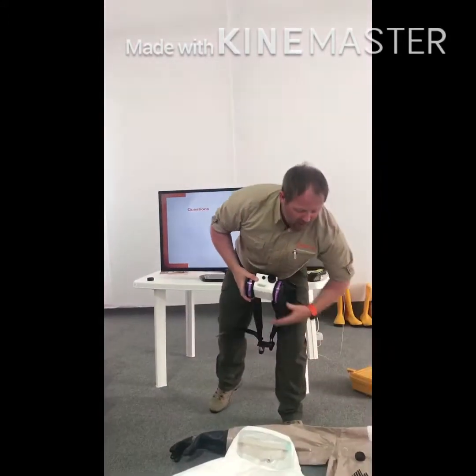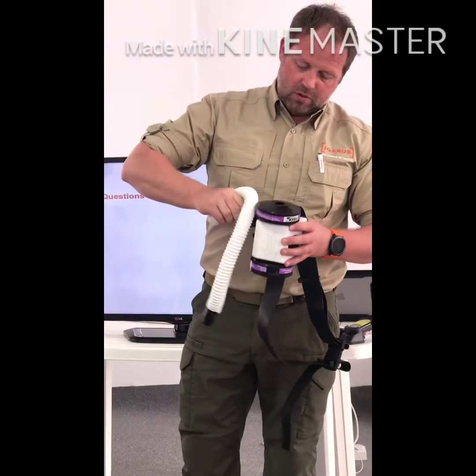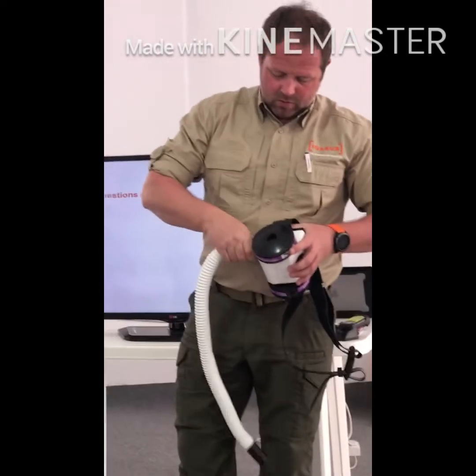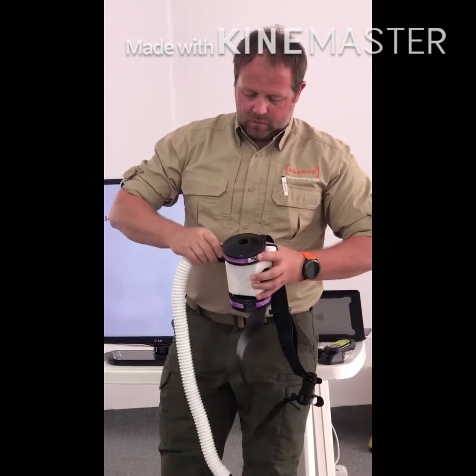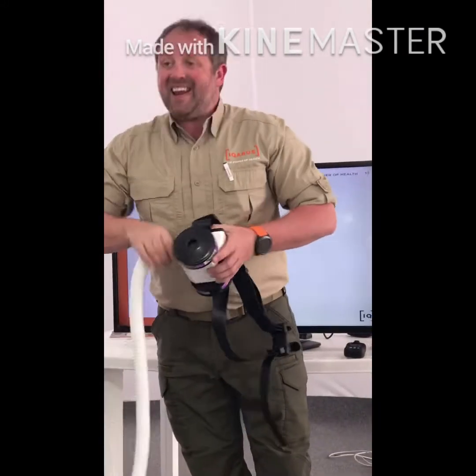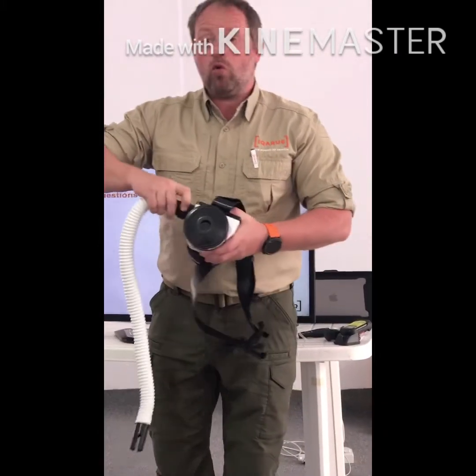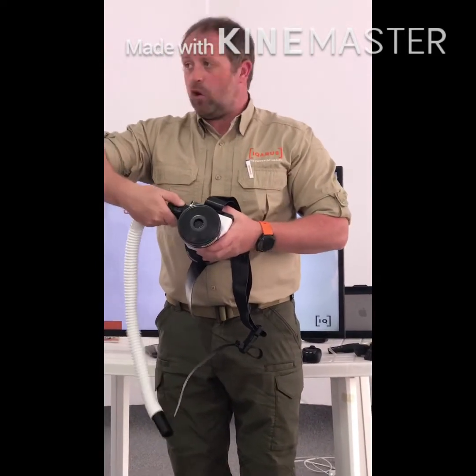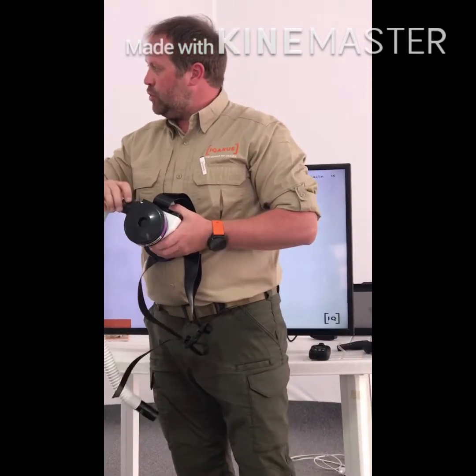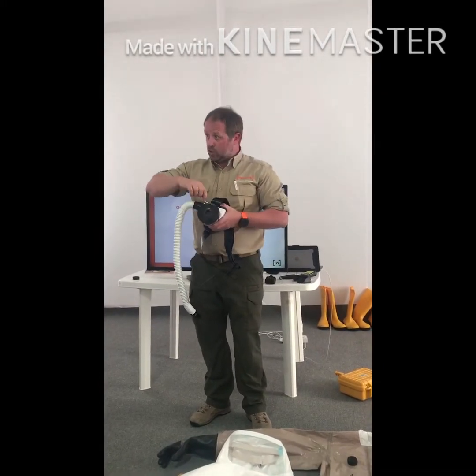Turn it off and remove your filter check. Then attach the PAPR tube onto the coupling. Right. Again, anything that screws on, okay, I always turn it the wrong way first because it allows it just to drop in. Okay? Because the last thing I want to do is start trying to force it and then I'll break all the screw threads and it won't work. Okay? But you won't know it's not working until the chemical starts to seep in.